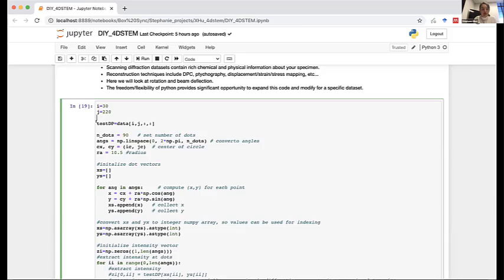The first thing I'm going to do is take one diffraction pattern and use it as my test. I set this flexible so I can change it. My advice is that as you're developing your own code and creating methods like this, leave this flexible and test your method on a lot of different pixels from different parts and different types of sample areas within your whole sample, because before you run on the full data set, you want to minimize error and erroneous information. What I'm going to do here is select my number of dots. So I picked 90.